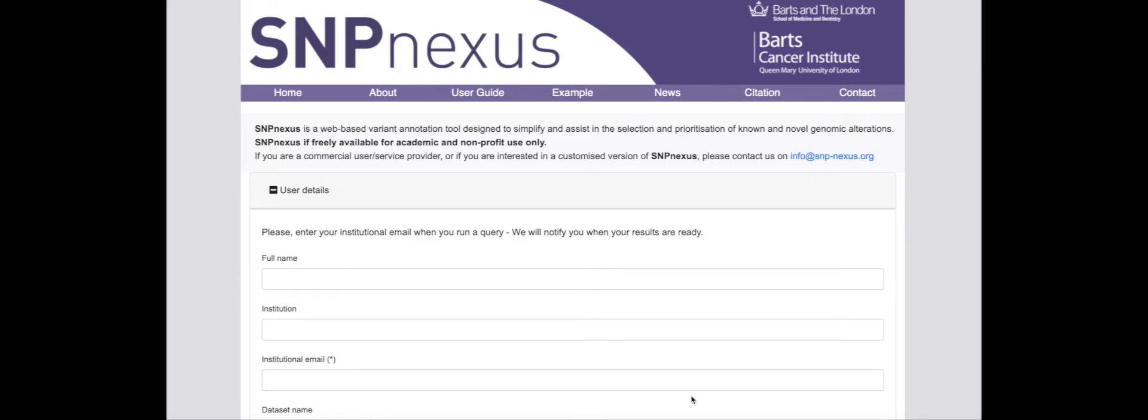Here, I will show how SNPnexus can be used to analyze sequence data from a patient with pancreatic cancer and identify important clinically relevant variants.